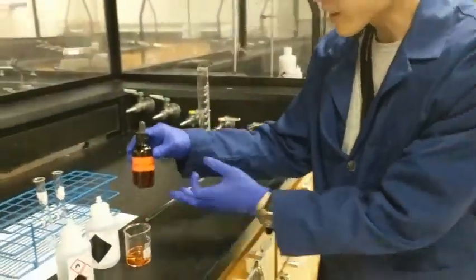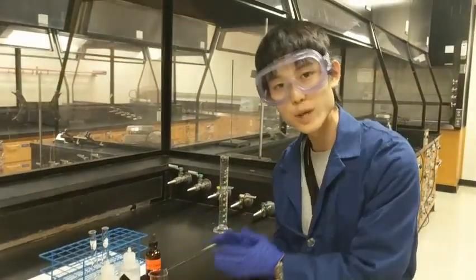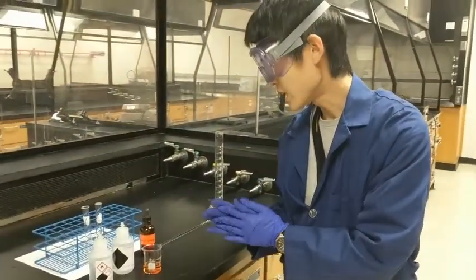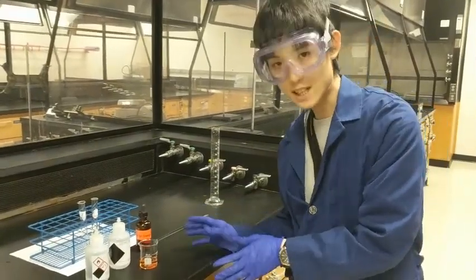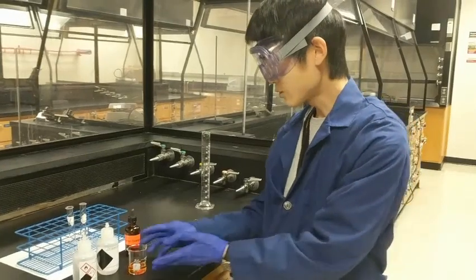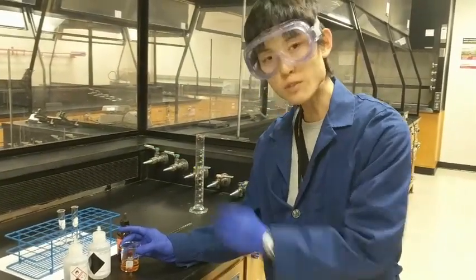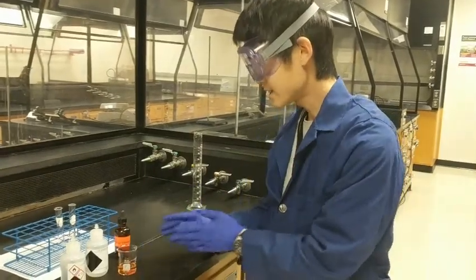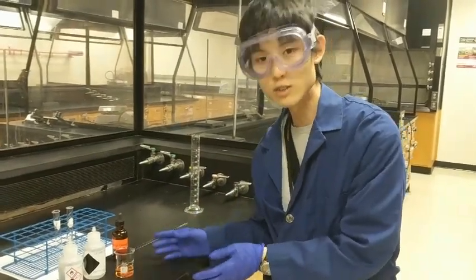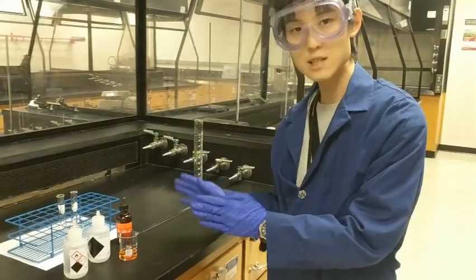This methyl orange indicator is red when the solution is very acidic, with a pH of less than 3.2, and when the solution is more basic, with a pH above 4.4, the solution will turn yellow. And the solution will be orange when the pH is between the two.